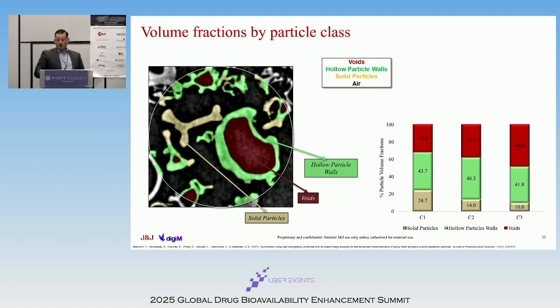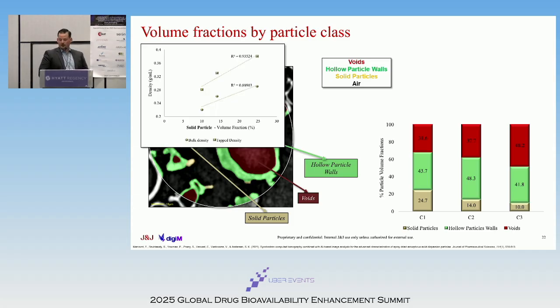I've seen data sets where we have every single one of those complicated particle classes I mentioned before. You can individually segment each one of those out and analyze them separately. There's also some of this data that can be suggestive of some convolved features, like is there a difference in wall thickness potentially, but we can actually deconvolve that, as you see, as we press into additional characterization from the segmentation.